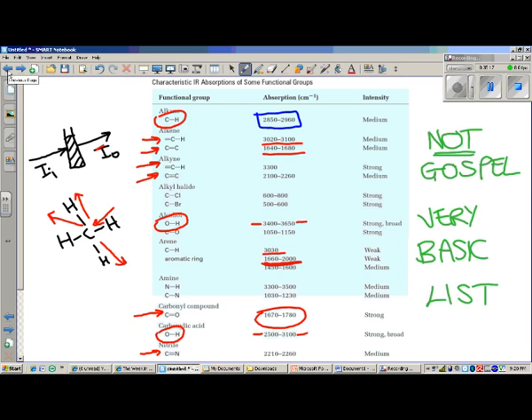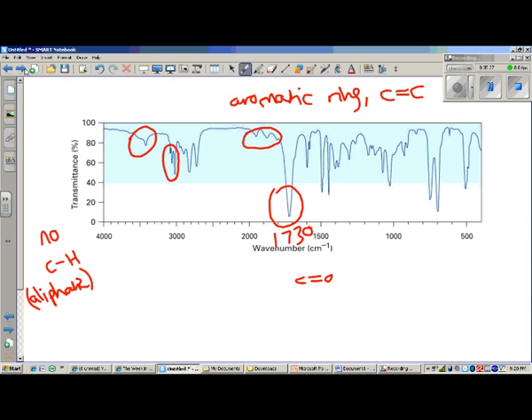The only thing that we can't see from this table, and again this is why having something more comprehensive is useful, is that this group is actually a very small peak associated with a CH on a carbonyl group. Again, our table doesn't show that, but I'll be giving you something in class that does illustrate this more clearly, or in more detail at least.